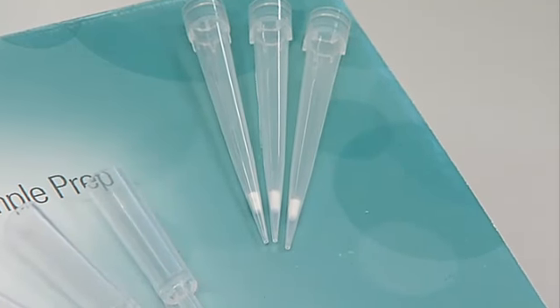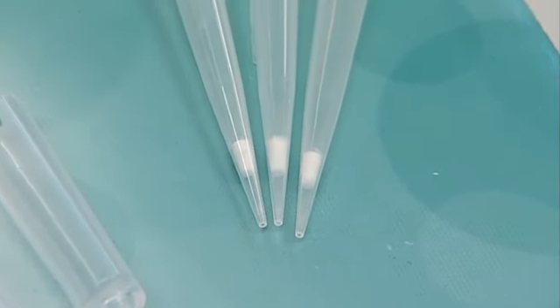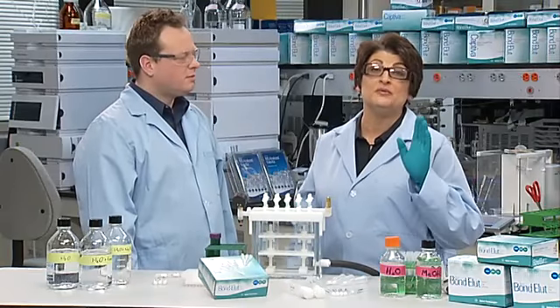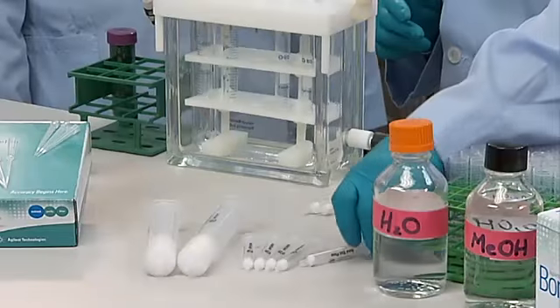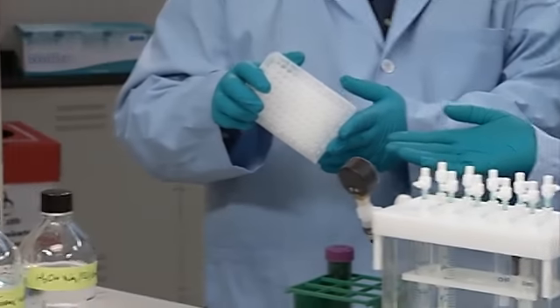In this design, SPE material is placed within a pipette tip, allowing for miniature bed mass and volumes. Let's take a look at some examples so we can determine how to choose the right SPE format for our method. For small volume biological samples, choose a small bed mass, such as a 10 milligram to 100 milligram, and SPE formats like the 1 milliliter cartridge or 96 well plate.